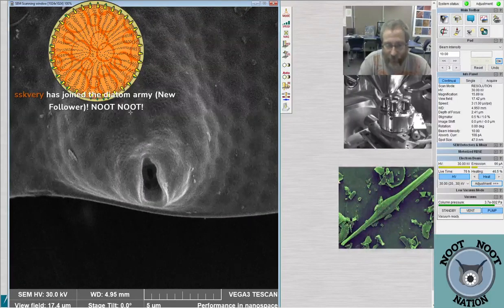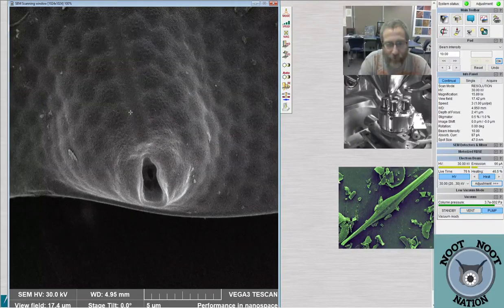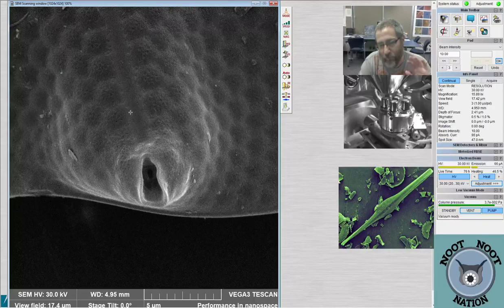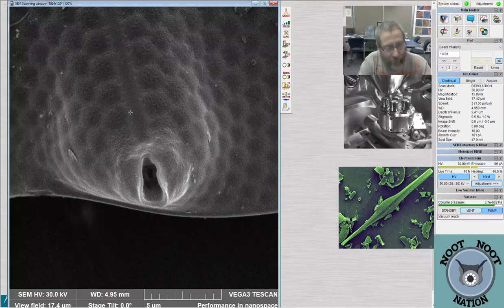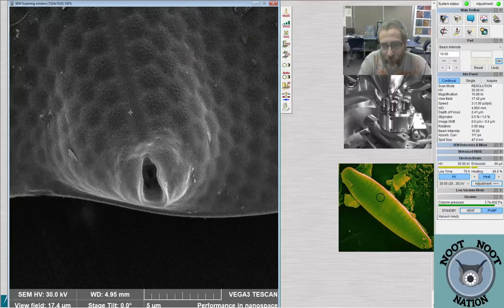And you have to have something that's not moving. Otherwise, it can't figure out which things should be in focus. But it will stack all of the parts that are in focus together. And my camera in the lab, that's the stereoscope, actually does this too. In the SEM, we don't really need to do that.